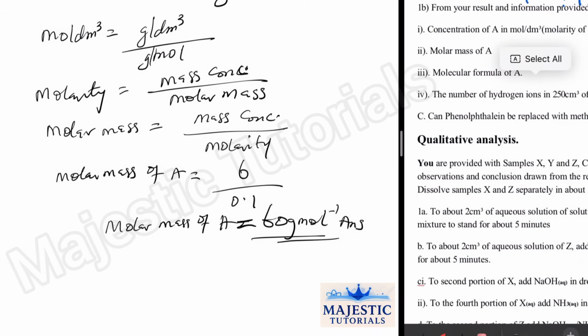the molecular formula. Yeah, the molecular formula of A. Yeah, this I'm highlighting. So we can now forge ahead. The question has already told us, look up here, that A is RCOOH.